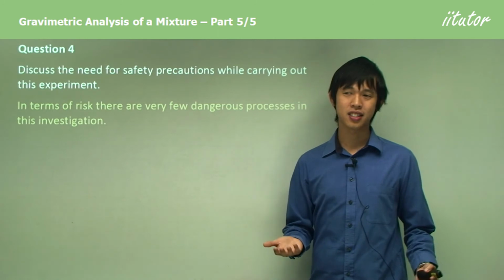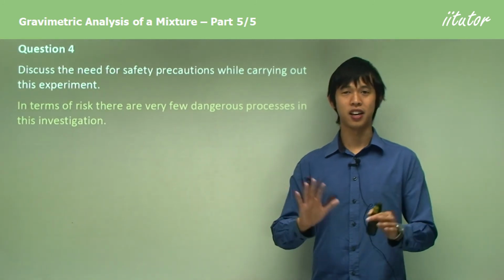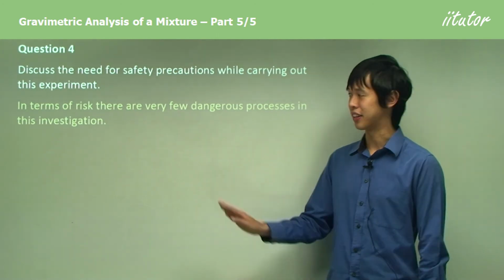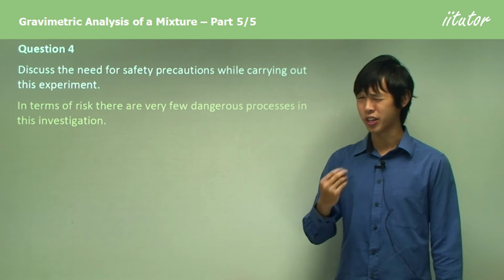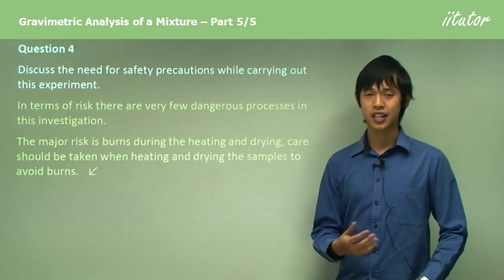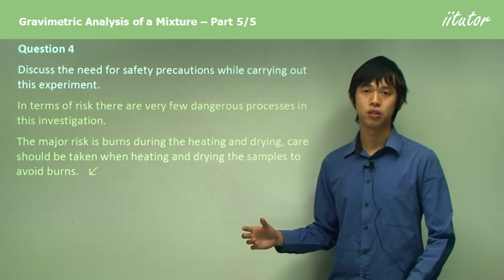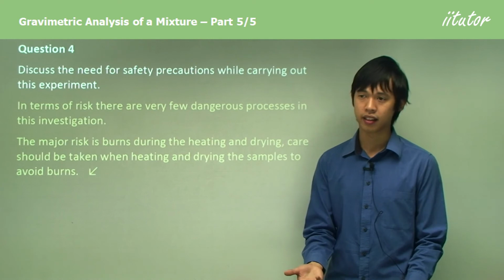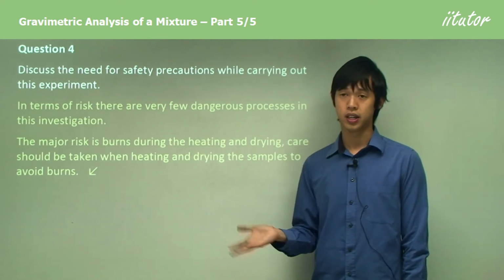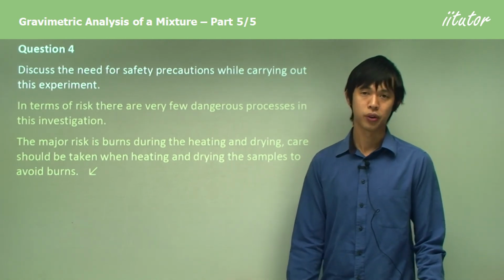For instance, glass, I would expect that people don't break glass. Obviously, that's one danger, but that is so much common sense that we'll just ignore it because we expect that you don't break the glass. But the real risk here is burning yourself. Now, obviously, again, that seems like common sense, but there is an element of risk when you are boiling or heating things, and burns are particularly nasty, right? You just have to be aware to avoid burns because that is just one risk of this experiment.